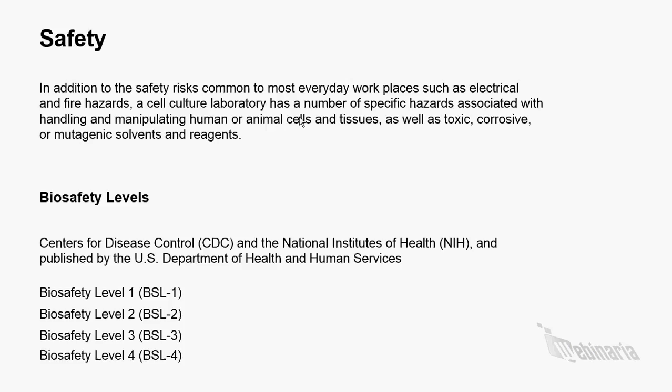There are certain types of biosafety labs available. The Center for Disease Control, NIH, and the U.S. Department of Health and Human Services generally publish biosafety regulations for tissue culture labs every year. It can be downloaded from the internet if you are interested to read it fully.